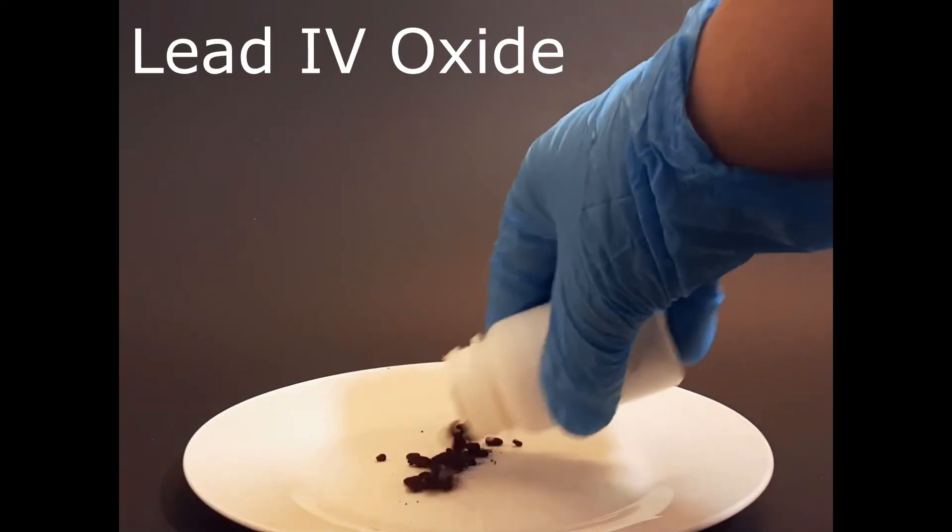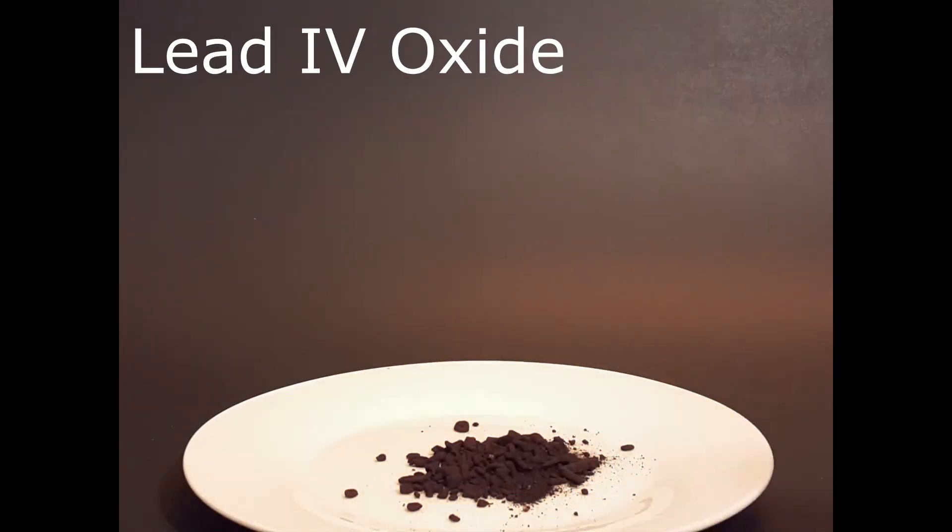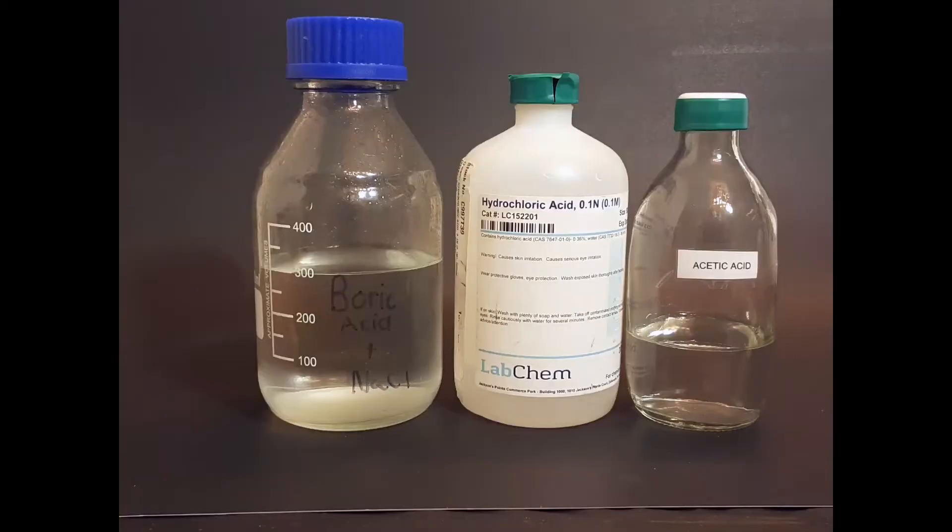Other chemicals are even more dangerous. Things like lead compounds like lead oxide and lead sulfate are extremely poisonous, not only toxic because they release toxic fumes, but if you were to ingest even a small amount of it, it would be very bad.